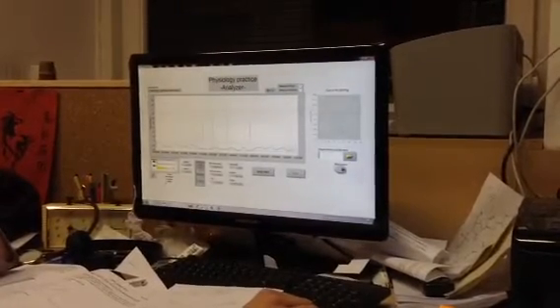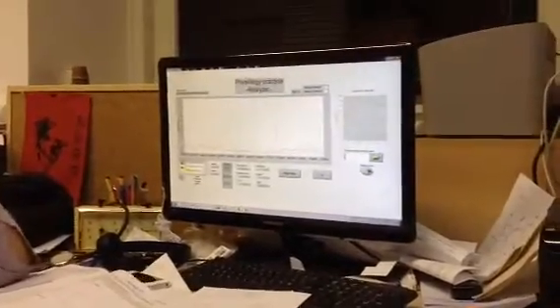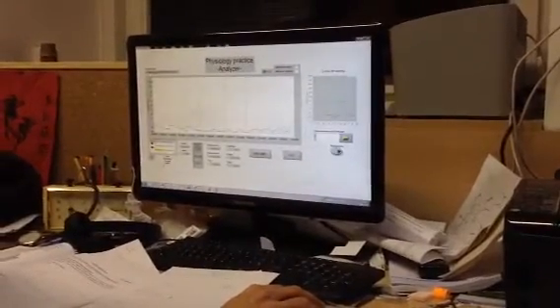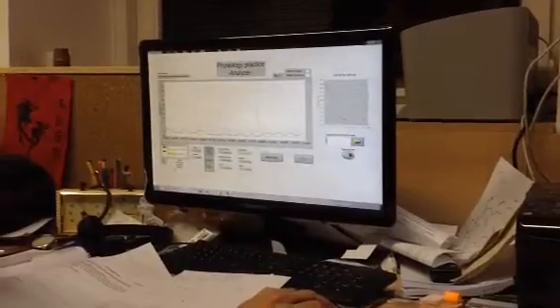All these together describe the activity. And HRT. Would you like to measure the HRT? In this case, you can see for this contraction. For this one, okay. With the peak, yeah.